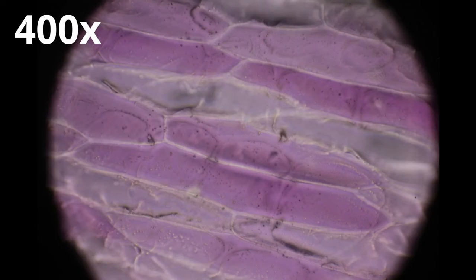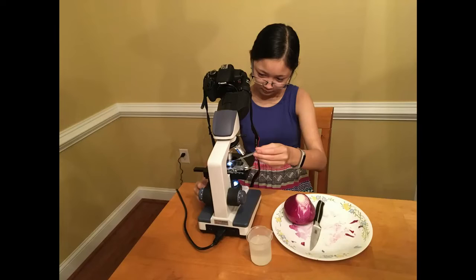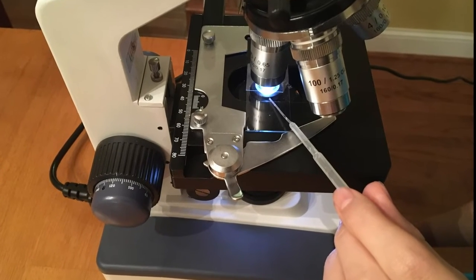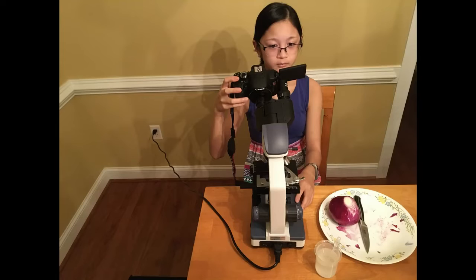Increase magnification to 100x and 400x by rotating the objective while keeping onion cells in focus. Look for a layer of healthy pinkish-purple cells. Transparent cells are empty cells without cell bodies. Using a pipette, squeeze a few drops of salt solution next to the cover slip until some of the solution goes under the slip and onto the onion cells.